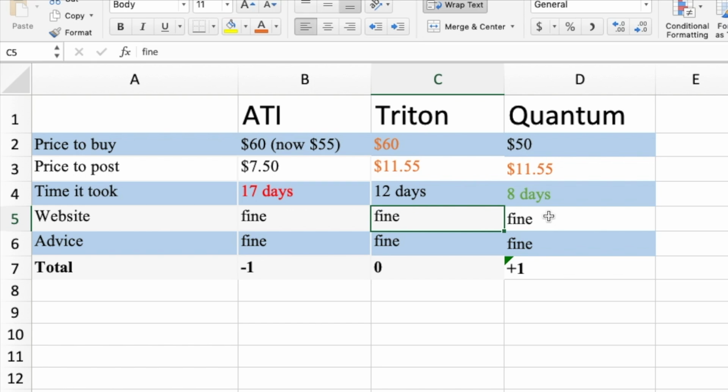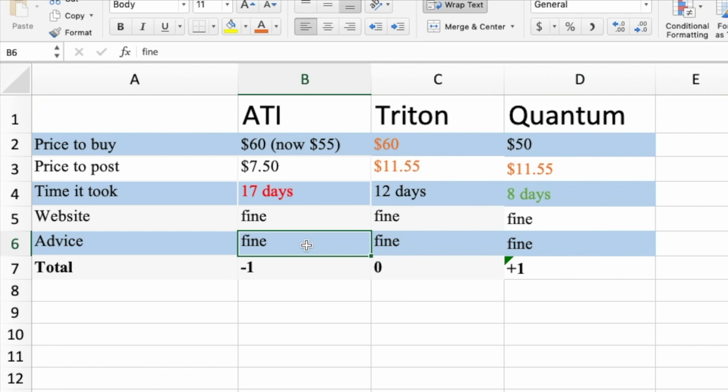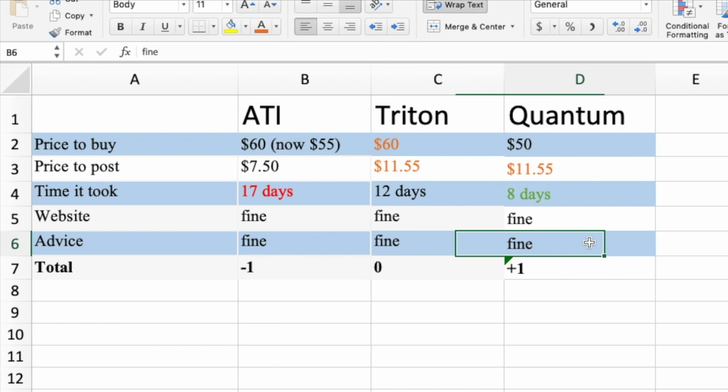And the Quantum results that come in a PDF with some good written instructions on what they recommend were fine as well. That leads on to the advice. Again, some of these I question a little bit. The Quantum results on a couple of elements, it said I was 400% the desired value, and the recommendation was to do a 20% water change.